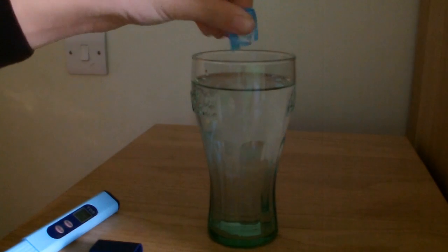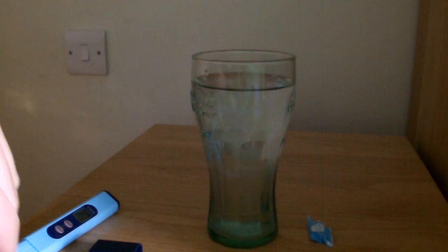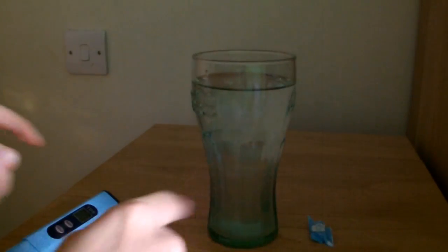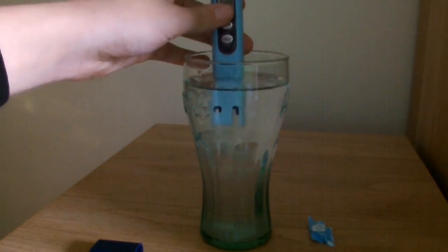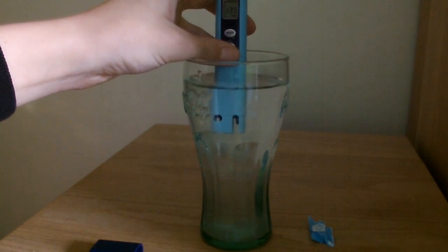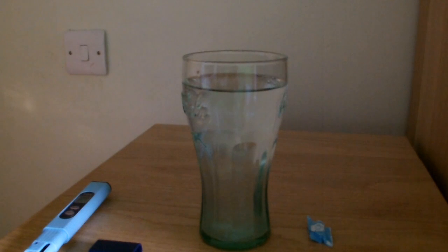In theory this should now have a higher PPM. That was 271 before — sorry, 171. Right, the problem I'm having is I haven't actually stirred that, so it's sort of fluctuating.